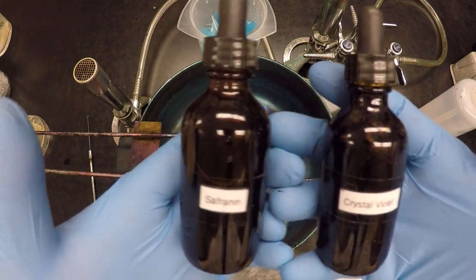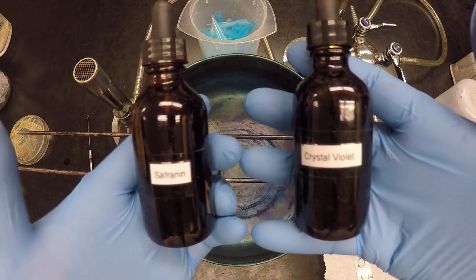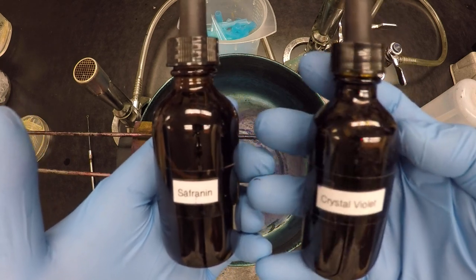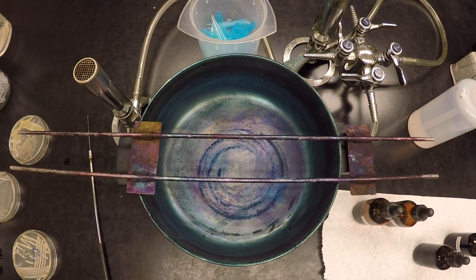So essentially, what we're going to end up with at the end of the day is purple cells or violet cells that are gram-positive, and then pinkish red cells that are gram-negative. Okay. So let's go through it very basic. It's not that much different from the simple stain, from the things that we've been doing, right?